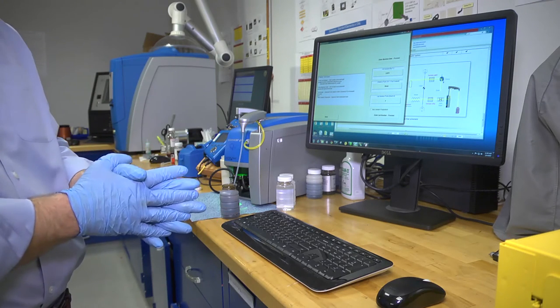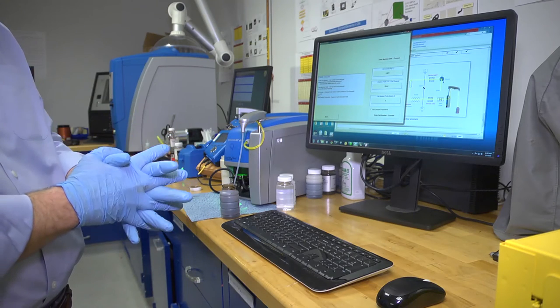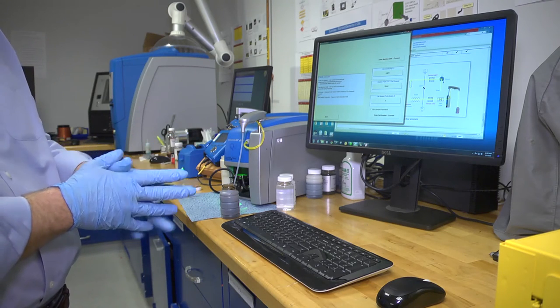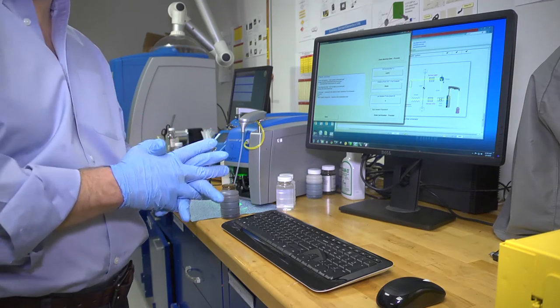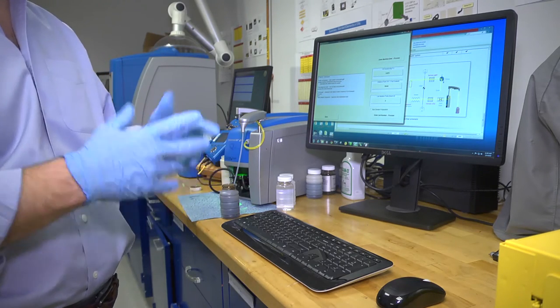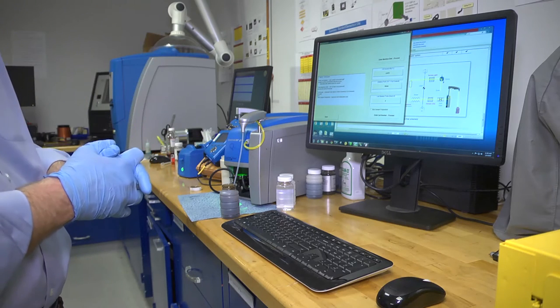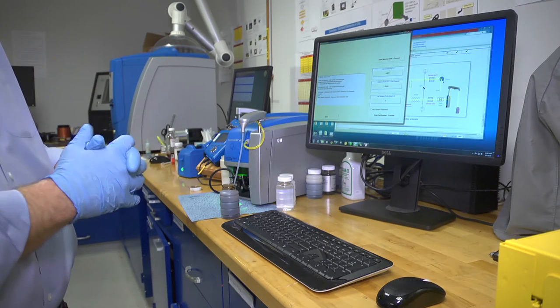It is not necessary to dilute samples up to 320 centistokes with the LNF. There are, in some cases, an extraordinarily dirty sample where it might be advantageous to dilute a sample. Nonetheless, with a very wide dynamic range of the LNF, which has the largest saturation limit of any commercially available particle counter, it's rarely necessary.